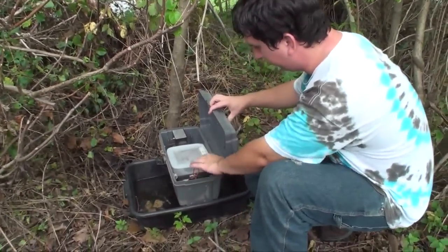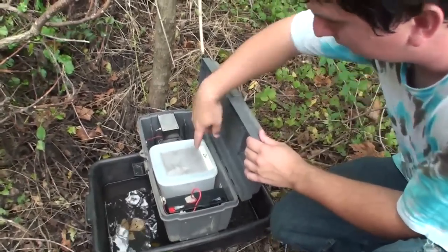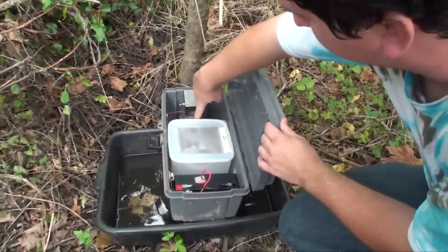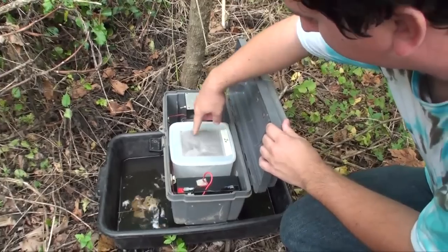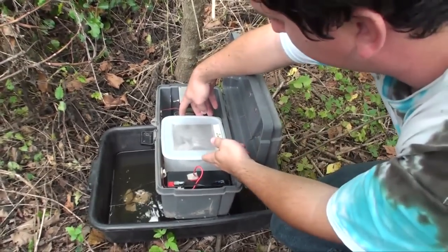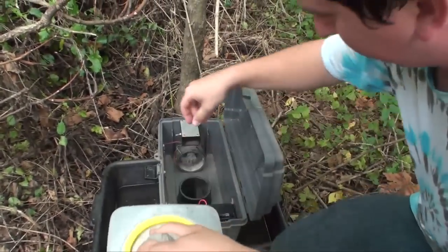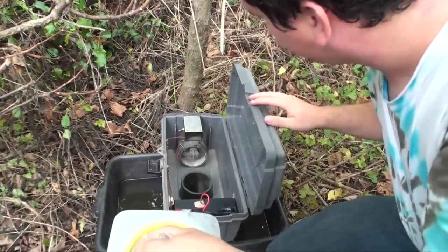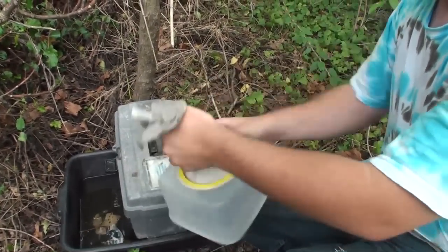It's run by a battery that runs a fan. There's a hole in the bottom of it that sucks the mosquitoes up into this chamber, displaced by the fan. Then we'll just pull this trap out like that, and we just secure the bottom.